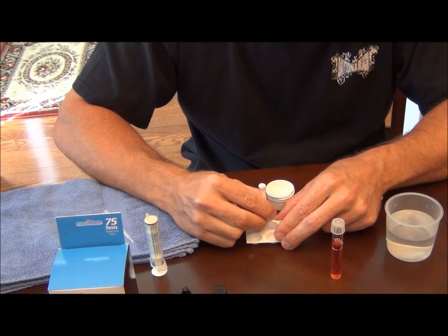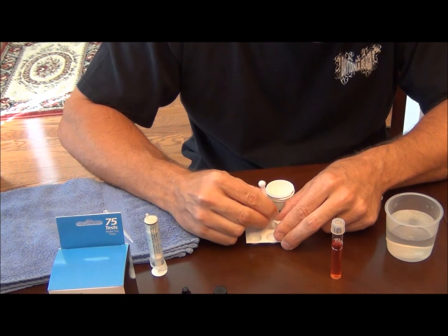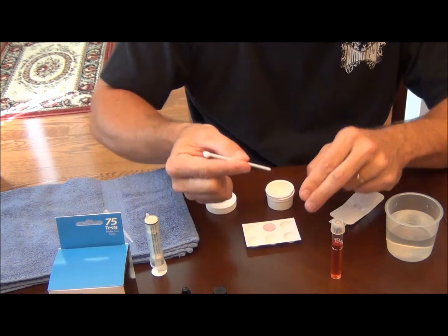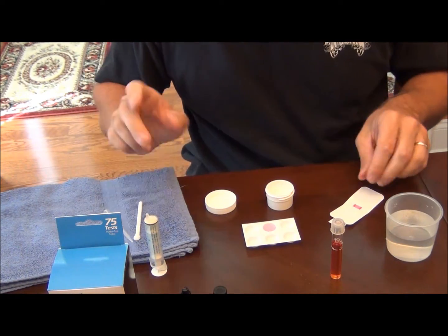It takes five minutes for full color to develop on the API test kit, and between five and eight minutes for it to develop with Seachem's nitrate test. We're going to let that sit and talk here for a few minutes.